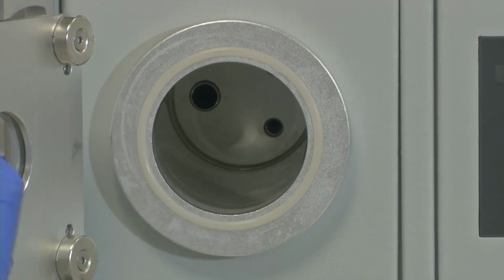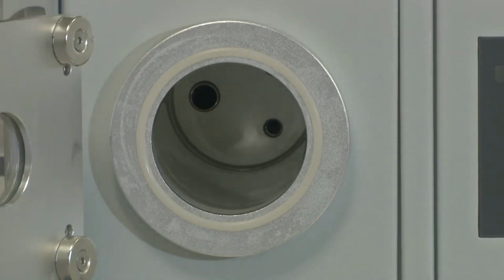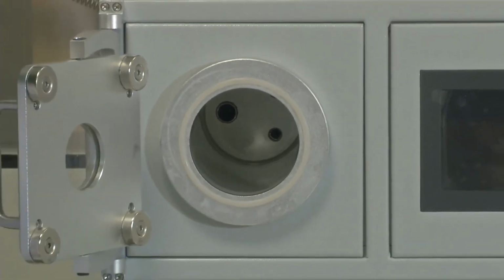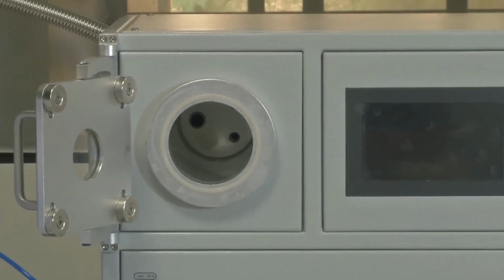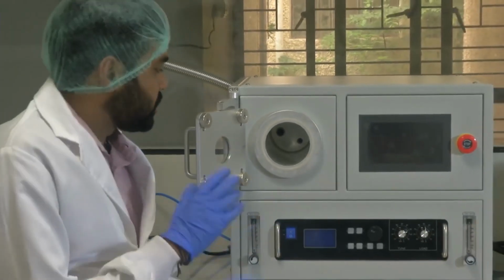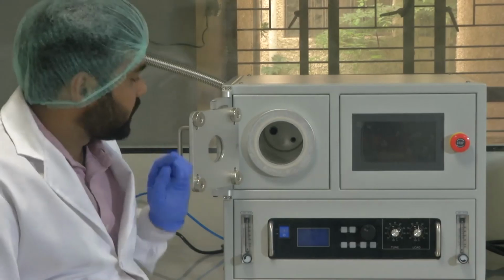There is a big hole. That is from where air is sucked out by the vacuum pump. There are 2 small holes, right? Those are gas inlets for giving 2 different gases. This system allows for 2 different gas inlets, so you can have a mix of 2 gases to create plasma, which is sometimes useful. Then finally there is a vent port through which you can vent. So those are the ports you can see inside. Now let's zoom out.